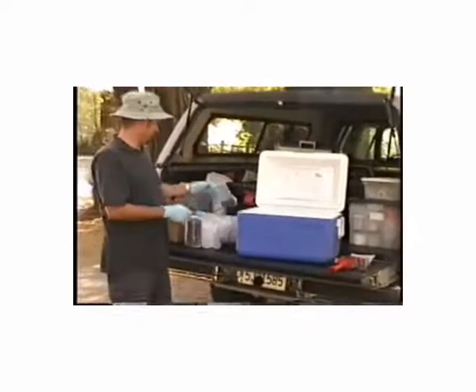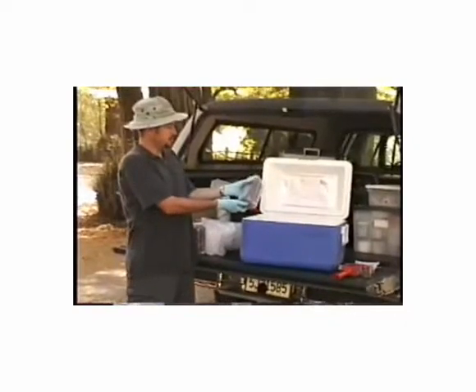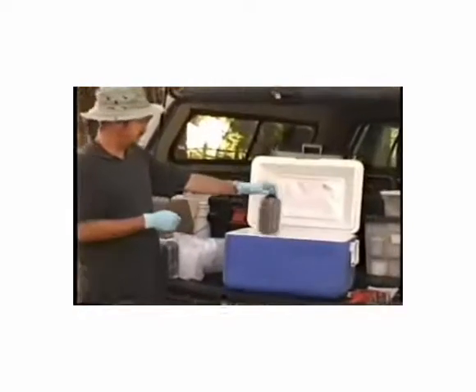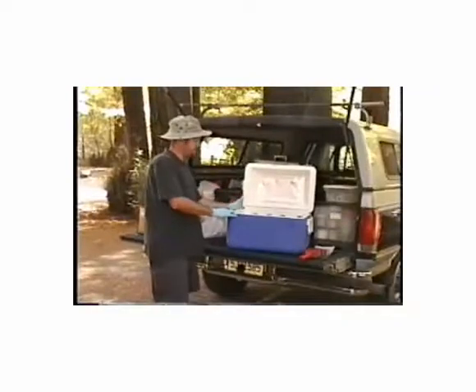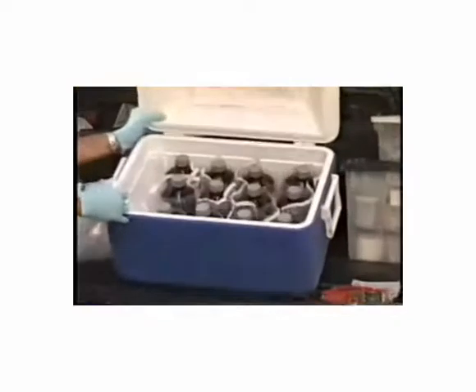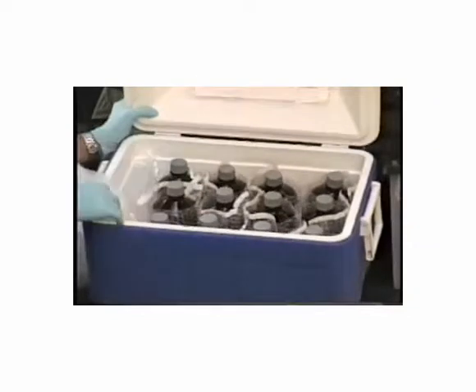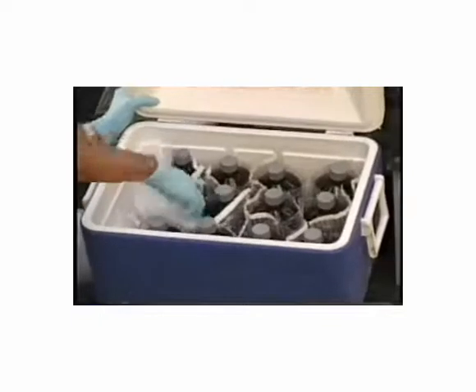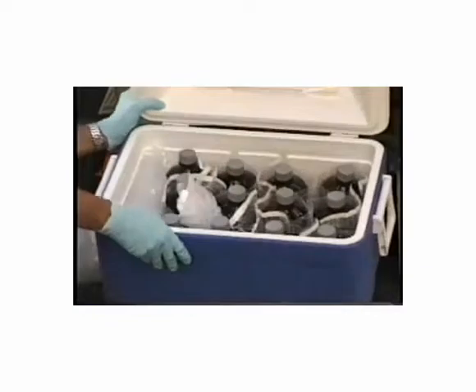We then bubble wrap all of our glass bottles securely, making sure that the bubble wrap is all the way to the top of where the glass is, and then we start placing them in the cooler. Depending on the number of bottles that you have in your cooler, you want to make sure that the bottles all fit pretty tightly and snug with bubble wrap in between each bottle. If we do have some loose spaces, I will take some loose bubble wrap and stuff it down in the empty spaces.